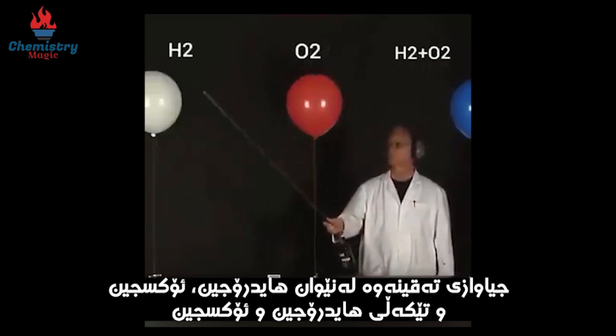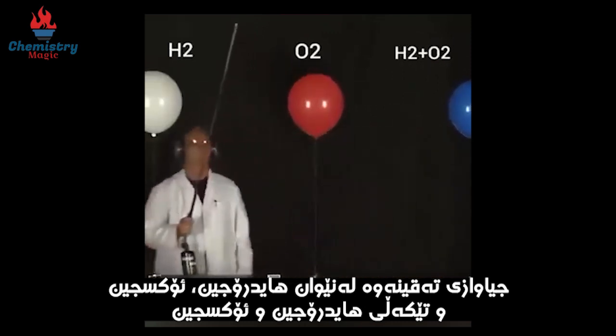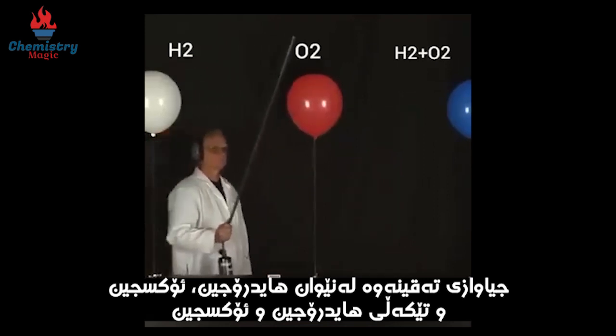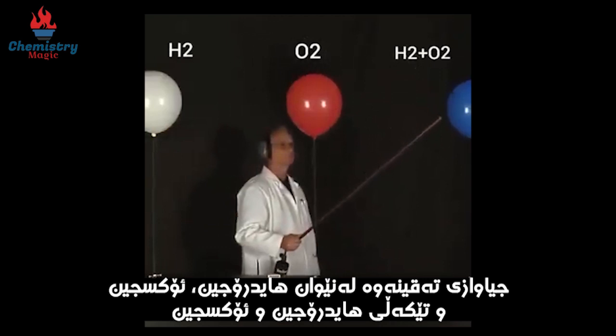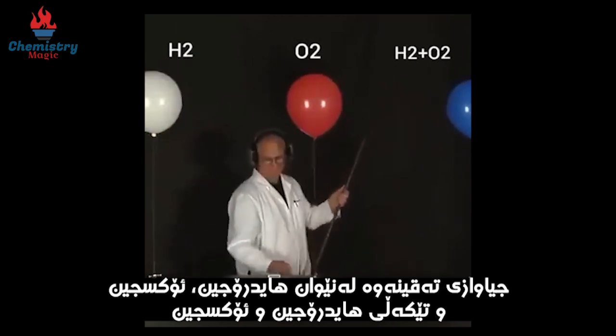You can actually see those three balloons. Here's a balloon filled with only hydrogen, a second balloon filled with only oxygen, and a third balloon filled with a mixture of hydrogen and oxygen. Lonnie will ignite the balloons with his long torch and we can observe the intensity of the explosions.